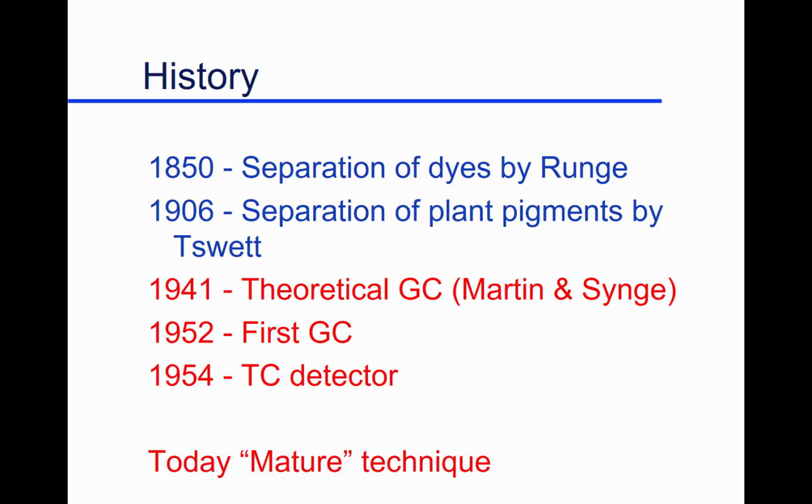The first gas chromatograph was built in 1952. So that's interesting. 11 years later, they figured out how to turn theory into practice. But that's kind of an interesting chromatograph because they had somebody sitting at the end of this column, and you'll get a vision of this later on, collecting whatever's there and then adding phenolphthalein and titrating it. So that was your detector, collecting what came out and titrating it.